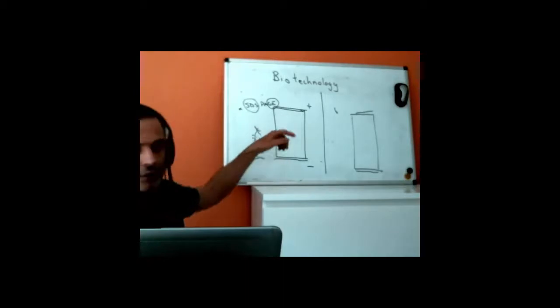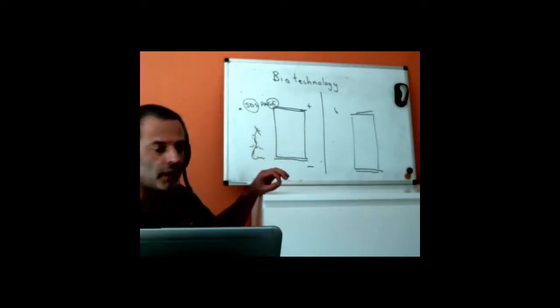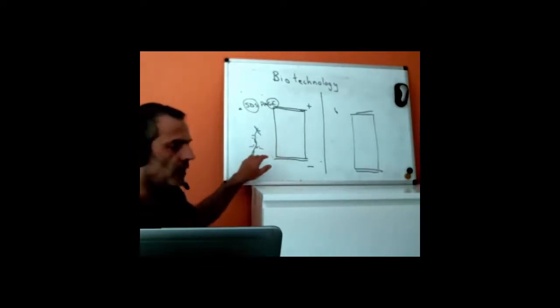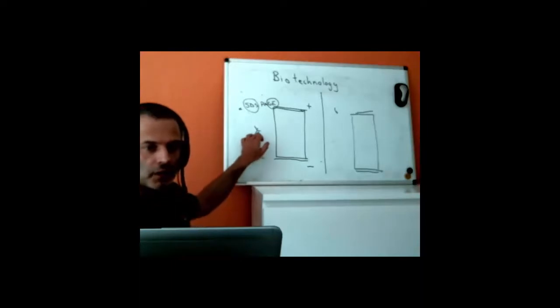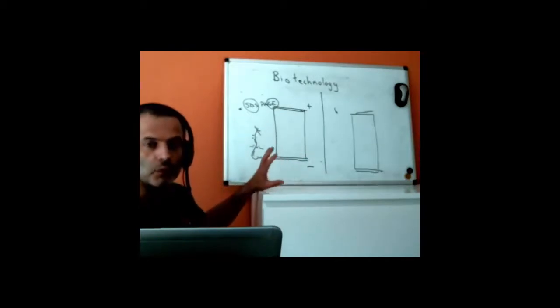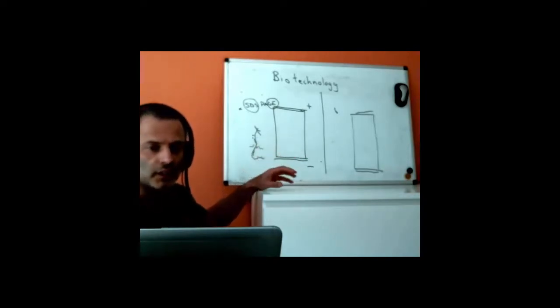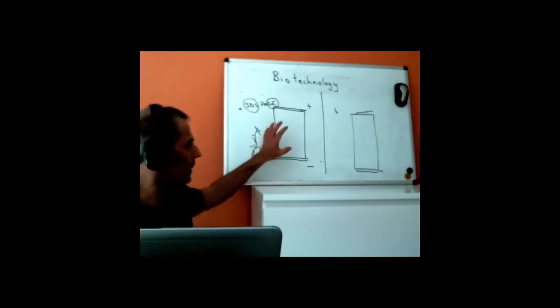So now we can do our electrophoresis exactly the same as we did before with the DNA, and we will get a measurement of the length of the protein, how many amino acids there are in it, directly from the same measurement. We will also have to do a comparison measurement with a standard because of the same problems as before, that the gel is difficult to get the same every time and that the temperature varies during the measurement very often, so we need a standard.